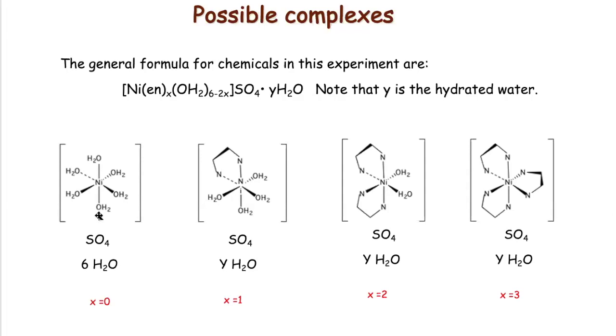They have to exist in an equal ratio because nickel is +2, and the only other chemical that's -2 to balance that out is your sulfate. So the moles of the nickel and the moles of the sulfate are the same, but the masses are not, because the atomic weight of nickel and the molar mass of sulfate are different. The moles are equal, but the mass is different.